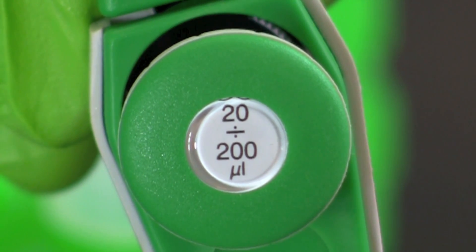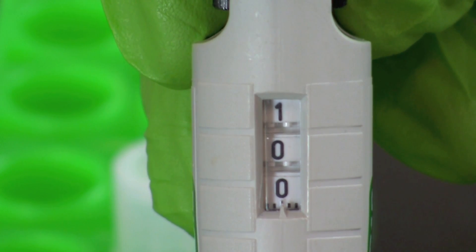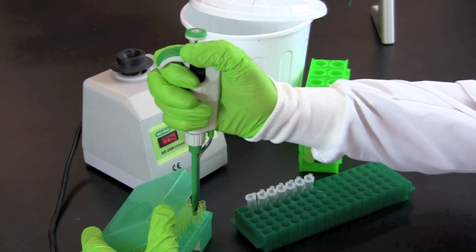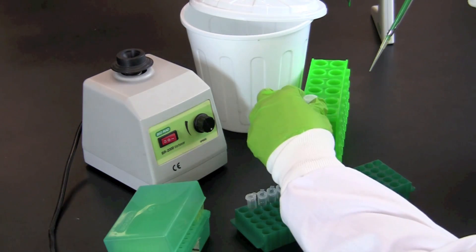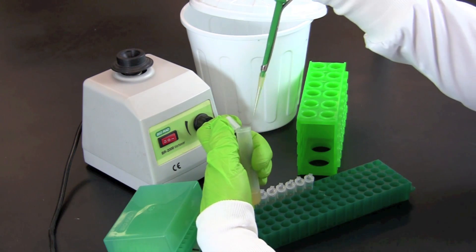Next, using a 20 to 200 microliter micropipette, set the volume to 100 microliters. Using aseptic technique, pipette 100 microliters of bacteria culture into the microcentrifuge tube labeled 10 to the 1st.